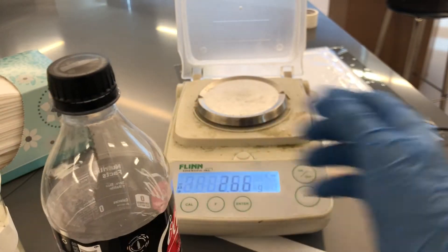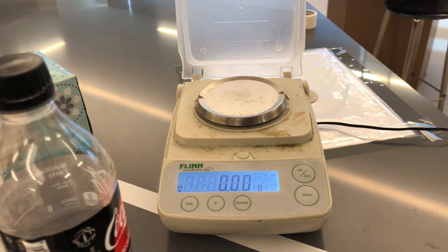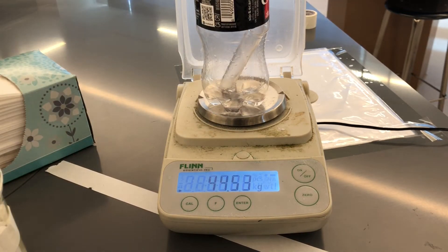So this is my system before the reaction. Everything is together. Now I look at the balance — I've got to zero it — and I want to find out how much it weighs before I shake it to cause the reaction to happen. So let's take a quick look: 44.53 grams.